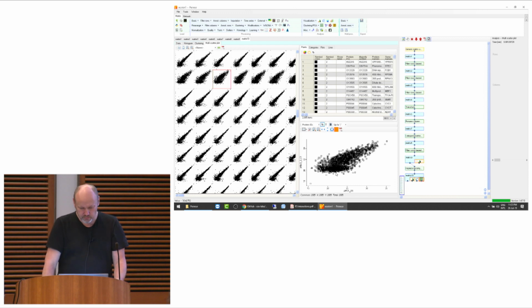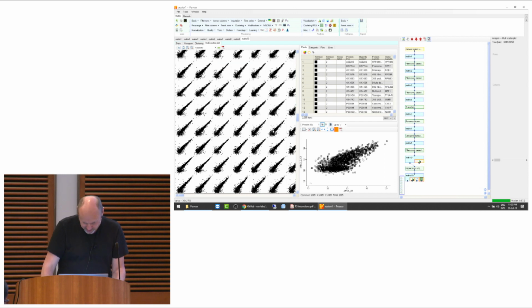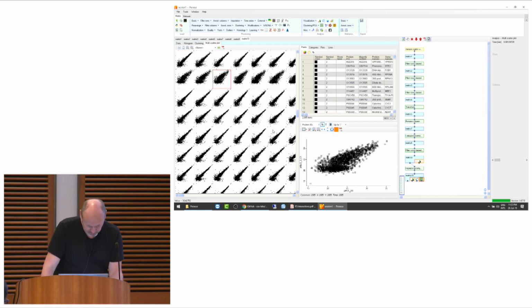So one may or may not, the standard thing would probably be just to exclude it from the data analysis, which means that one of your quadruplicate groups is now a triplicate group, which is fine. You can still use it for statistical testing. So that's also one reason why it's always good to have quadruplicates instead of triplicates, because then if one of them shows this kind of behavior, you're still left with three. And with three, you're in business with statistics, basically, right? Okay. But let's leave it in for now.